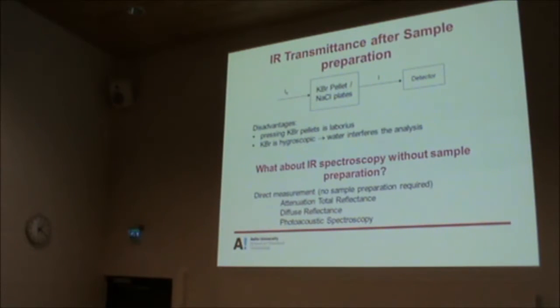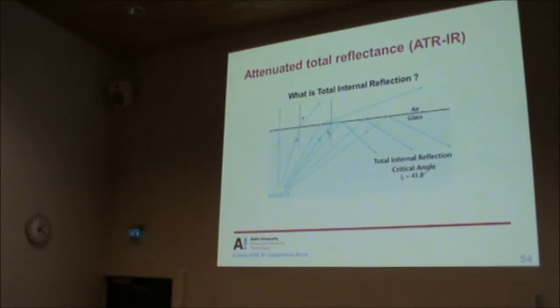What about infrared spectroscopy without sample preparation? There are three ways we can do that. I'm going to talk about three ways, maybe there are more. One is based on total internal reflection. We'll start with that.